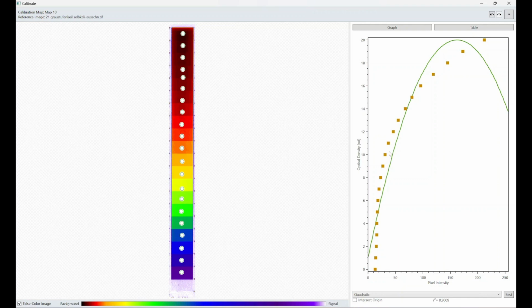The benefit of which means if you've got a lab in Shanghai and they're scanning documents and you want to analyze them in Amsterdam, or send them somewhere else, to America, if you've got 3 or 4 labs all across the world, all using different equipment, you can still be sure that when one analyzes an experiment, their results are going to be comparable to the results analyzed somewhere else because they're all working off the same reference values. A pixel value of 10 is always going to be an optical density of 0.5, for example, regardless of what it's been scanned on or where it's been scanned. So that's the benefit of calibrating your equipment and using calibrated images.